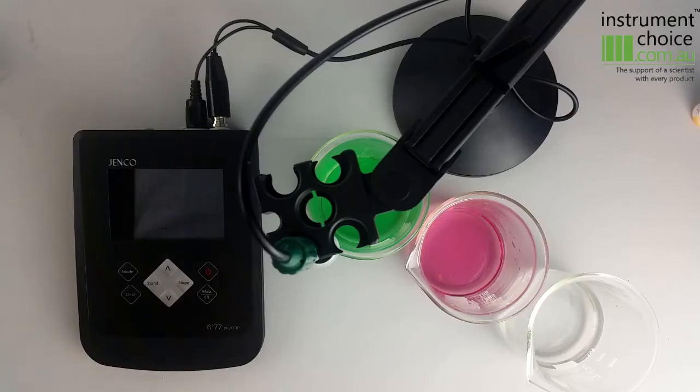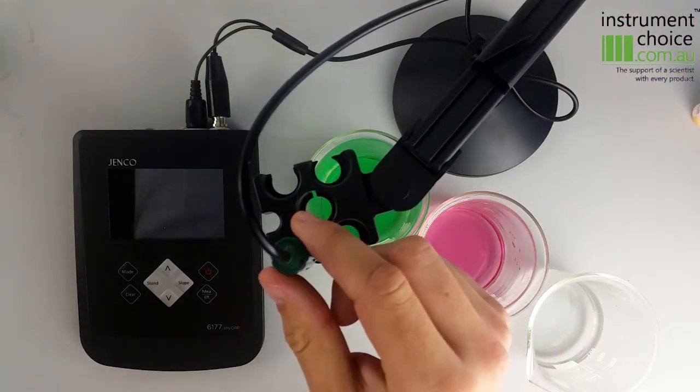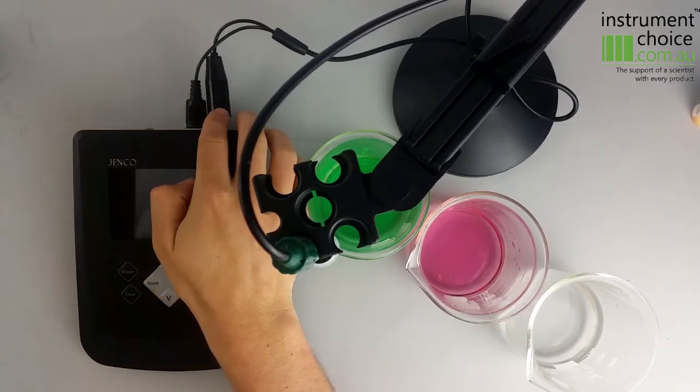In this month's newsletter video we're going to give you a quick overview of the Genco 6177KA, which is a basic benchtop meter kit. This little kit here comes supplied with your electrode stand and your pH electrode, which is an epoxy body electrode with a built-in ATC Pro.